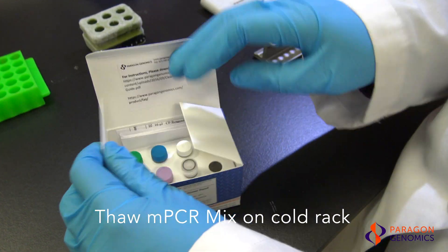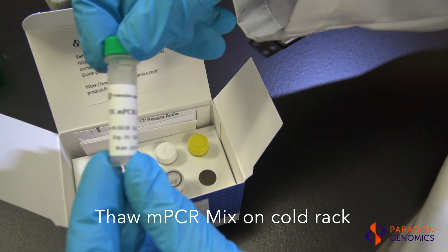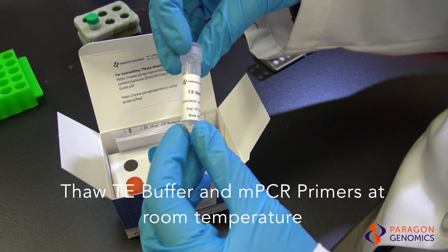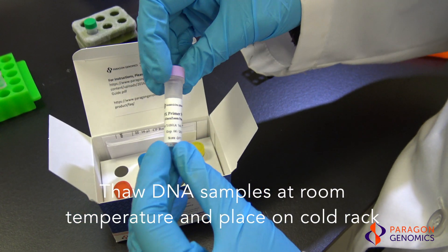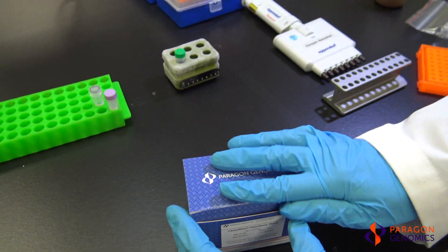To begin, take out the multiplex PCR mix from the box stored in the freezer and place it on ice or a cold rack. Thaw TE buffer and the multiplex PCR primers on benchtop at room temperature. Thaw DNA samples on a benchtop at room temperature and immediately place on ice or on cold rack once thawed.